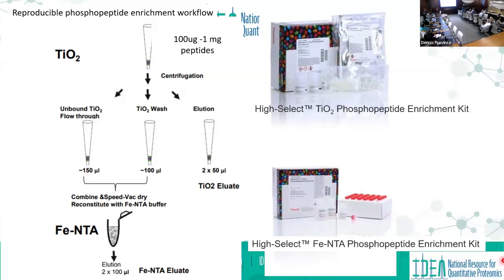And then I was at a mass spec conference. I saw a poster using these kits, and they had really, really good phospho data. And so I asked the person at the poster, is this a new kit? He's like, no, it's the same kit they've had for years. I don't believe it. I don't think it's real. He said, oh, they changed the buffers. The kit's the same, but they changed the buffers. The data was good enough that I tried it, and sure enough, it works, and it works really, really well.